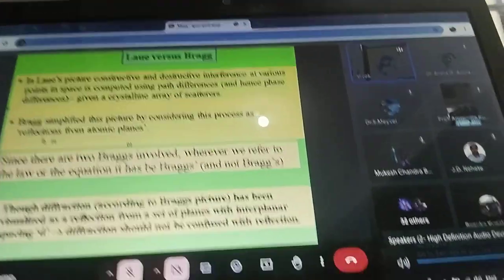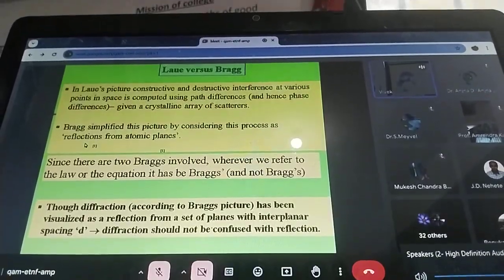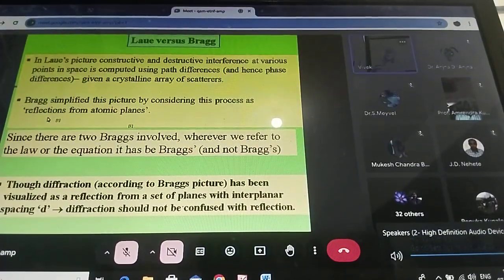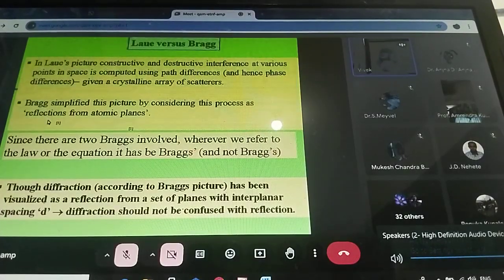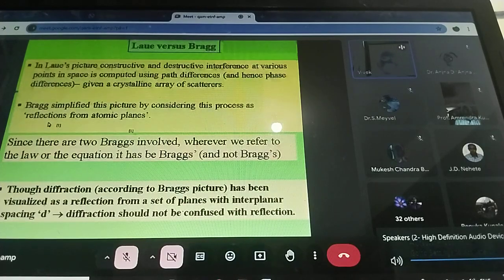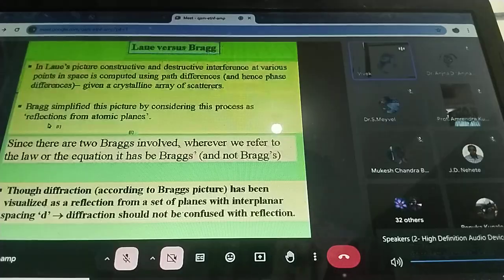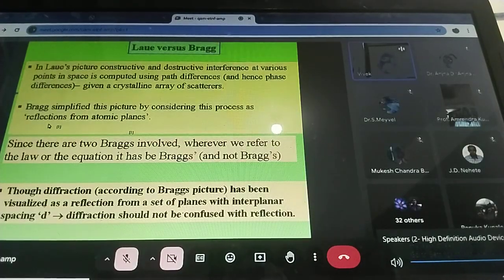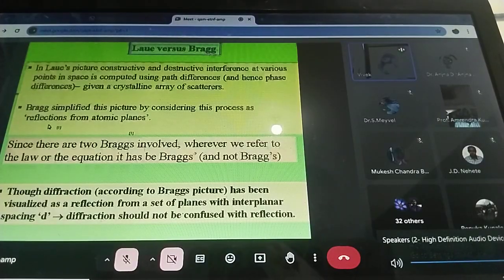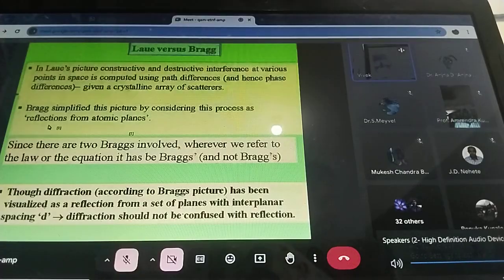Sometimes it may take some error. Instead of P21/a I may decide P21/c. So that is your expertise, how you select it. Once you have made out that your space group is, say, P21, then your work is reduced from 230 to 1. Otherwise I would have to try 230 space groups. Now you have restricted yourself to only one space group. Now you start your crystal structure determination.